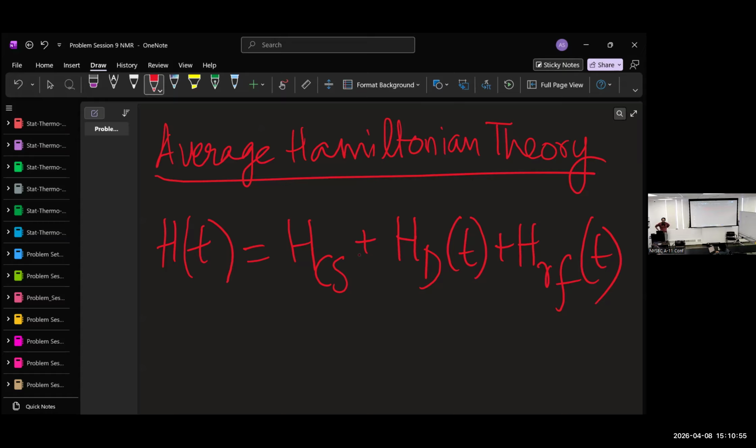We did an example in class where we talked about how to handle a time dependent Hamiltonian, which averages to zero under magic angle spinning. And then we showed how radio frequency intervention with MAS can recouple the dipole coupling in a way to effect magnetization transfer. So the example in class was Hartmann-Hahn recoupling.